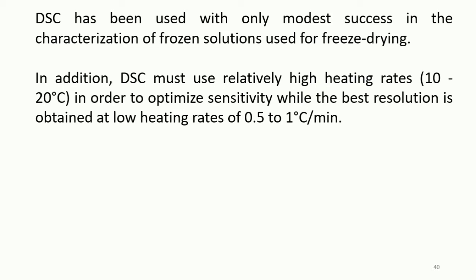In addition, the resulting modulated heat flow can be separated into the heat capacity and kinetic components of the total heat flow in order to improve ease of data interpretation.